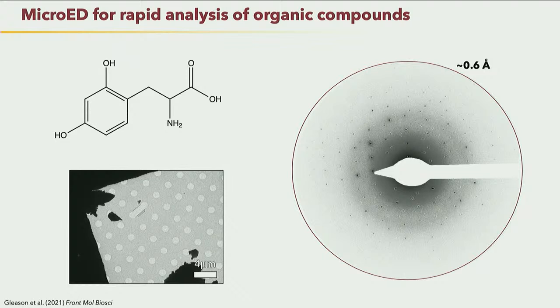So my friend's complaining about this over lunch, about the arguments they're having with the NMR groups, and so I said, do you have the powder? He goes, yeah. I said, okay, after dinner, let's go to the microscope. So we go to the microscope after dinner. He takes his powder, I put a grid inside his powder, put it in the microscope. Don't even cool the microscope down. Just pop it in, and we see little tiny crystals.